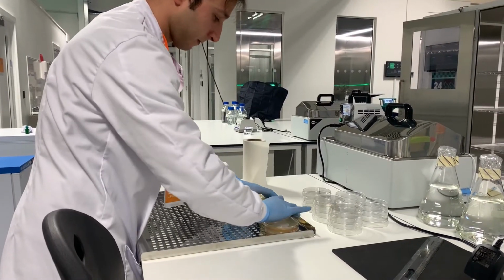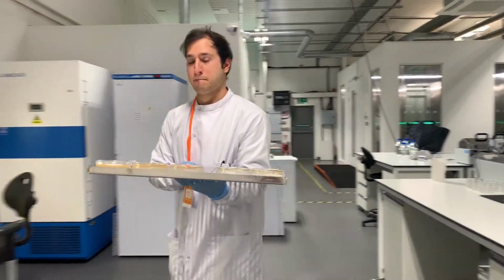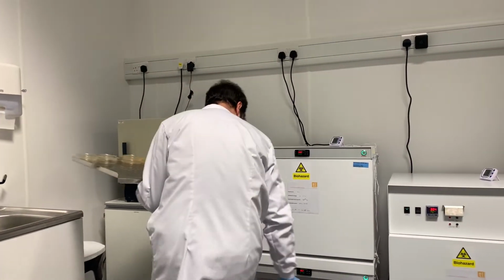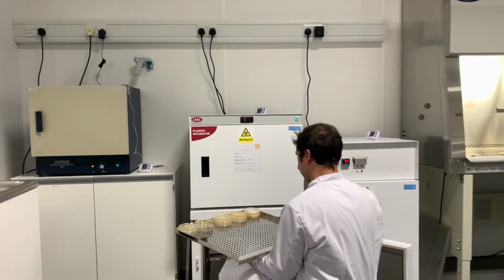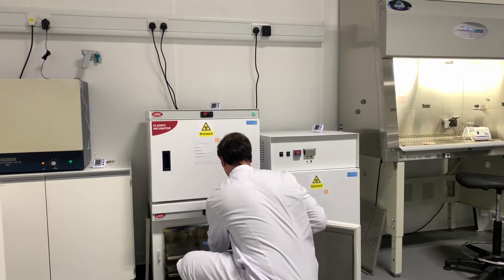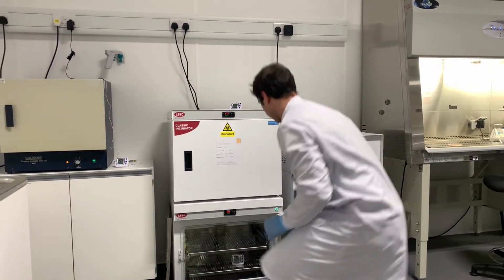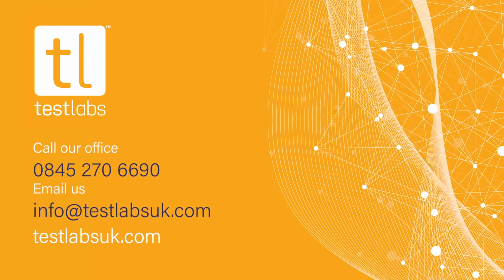All samples are then incubated at the appropriate temperature and time according to the organism being tested. After incubation, all plates are counted and the test carriers count is compared to the control carriers count in order to calculate the achieved log reduction. If the required log reduction is achieved on each organism of interest, the process can be deemed successful in claiming efficacy for airborne room disinfection by automated processes.